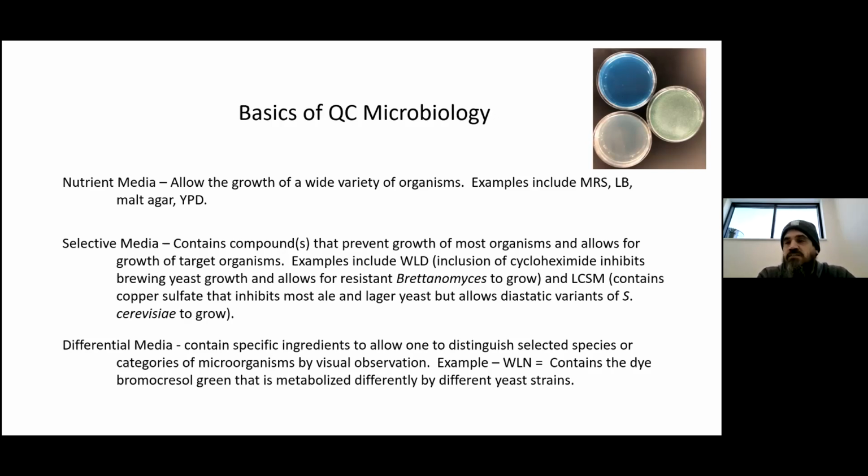It's really just a strange correlation that diastatic S. cerevisiae happen to be resistant to copper. But that trait allows us to use something like LCSM to select for the growth of diastatic S. cerevisiae.